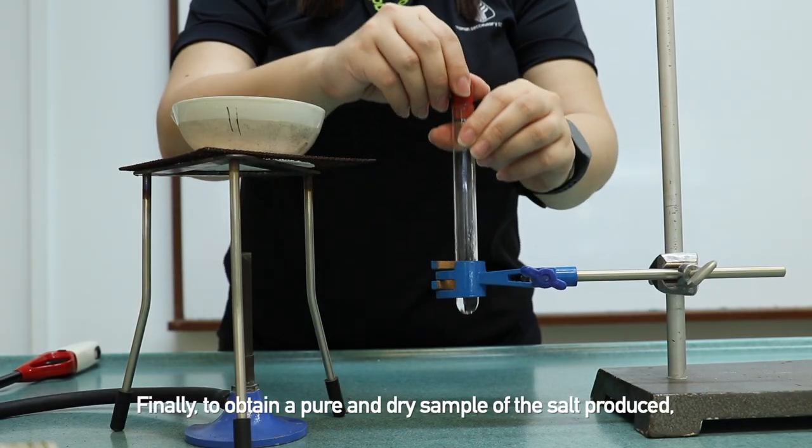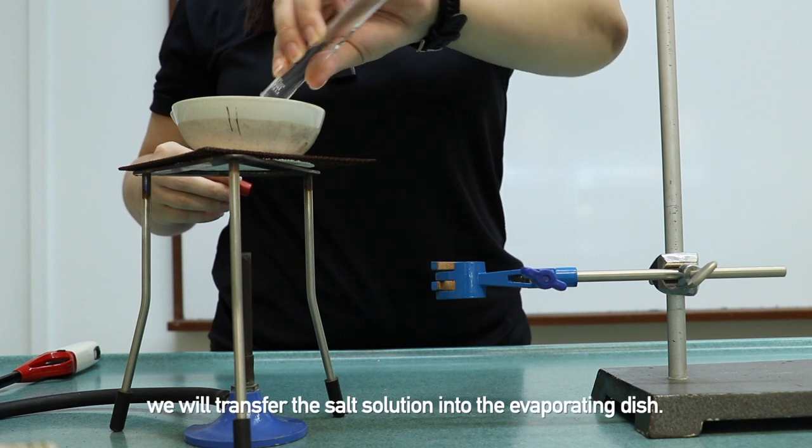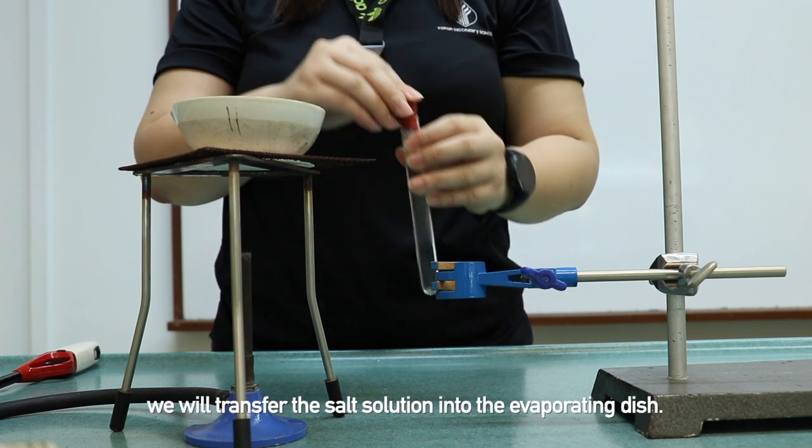Finally, to obtain a pure and dry sample of the salt produced, we will transfer the salt solution into the evaporating dish.